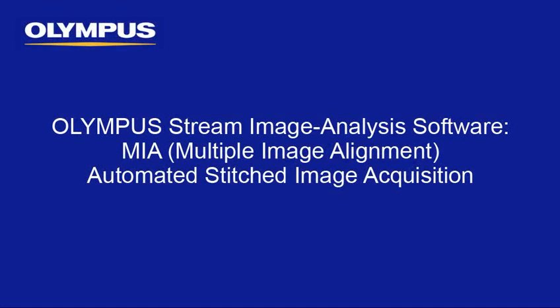This tutorial is one of many instructional videos presented by Olympus Industrial Equipment. This tutorial video will provide you with detailed instructions for generating automated MIA, or Multiple Image Alignment, within the Olympus Stream Image Analysis software.